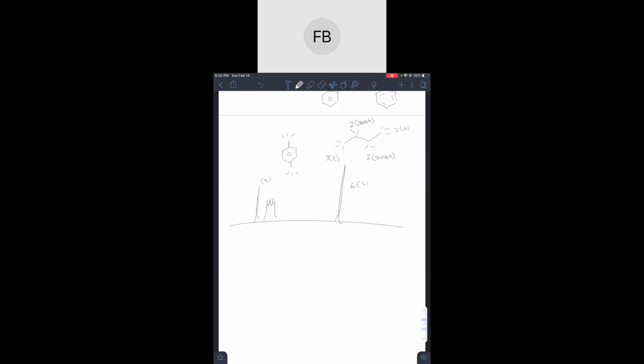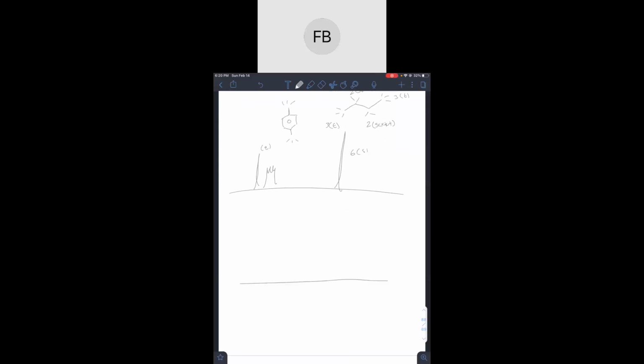Okay, now here's another example. So I hope you guys are getting used to this by now. In this example, this would actually be a triplet, right? Or I don't know, whatever. This thing right here, it tells us that it is like this, and it only has 3 hydrogens off of it. So we're just gonna put those, we know that there's like X, Y, and Z coming off of the benzene ring. Also over here, there's a 9H singlet.